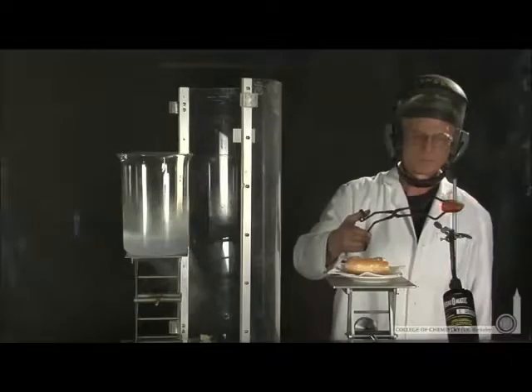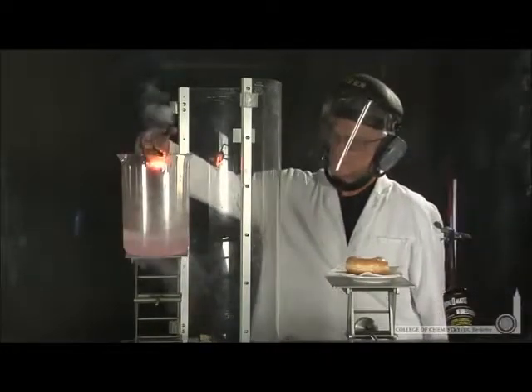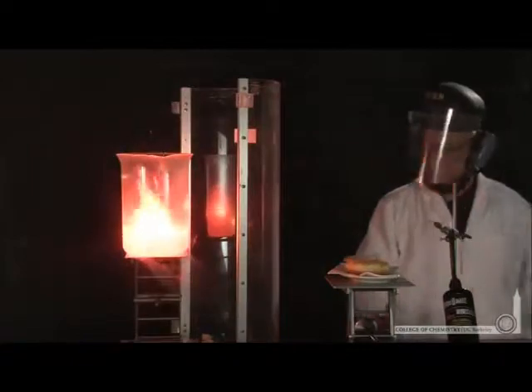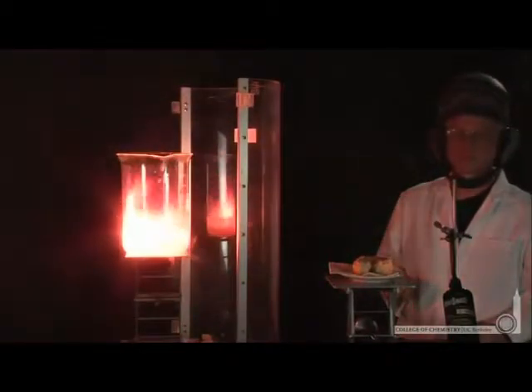So Lonnie takes the donut and he begins the combustion, releasing a small amount of the energy now as the donut begins to burn. Then he'll transfer it to the liquid oxygen and the energy will be rapidly released. Now remember, this energy released is the amount of energy that your body must burn off after consuming just a single bite of donut. Let's see how much energy that is. Clearly, the energy content of a donut, even this small bite, is very substantial.